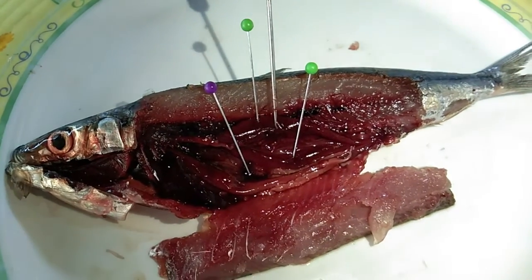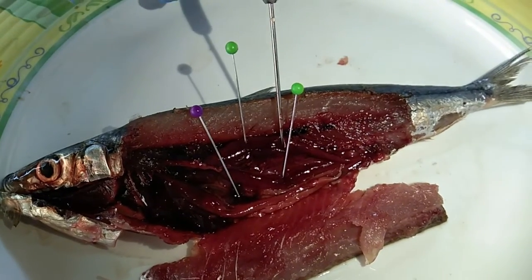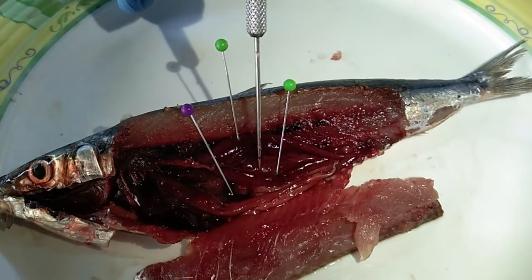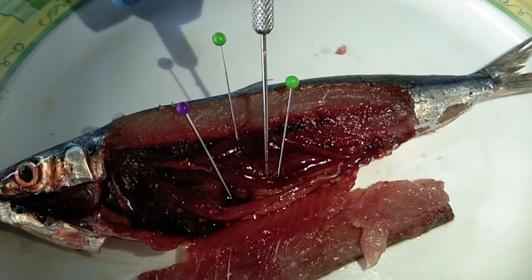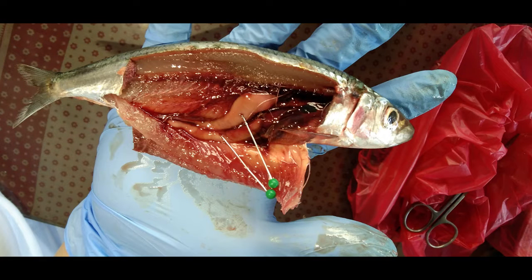For the reproductive system, both male and female gonads are identified. The female gonads are at an immature stage since they are translucent to rose color, with fine ovary and invisible oocytes. The male gonads are also at an immature stage since the testicles are small, translucent, and very fine.